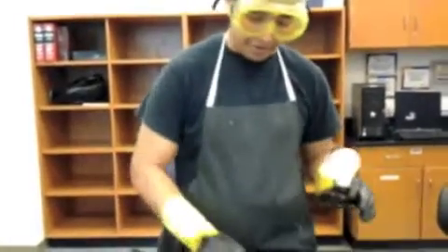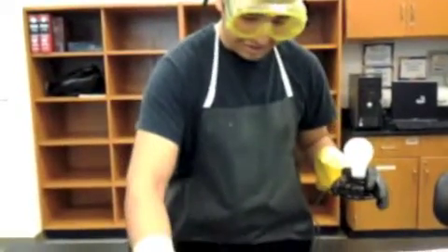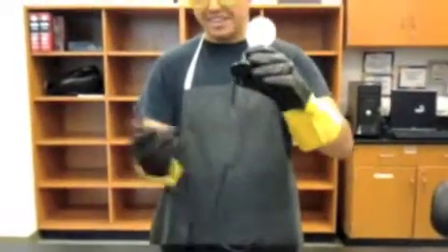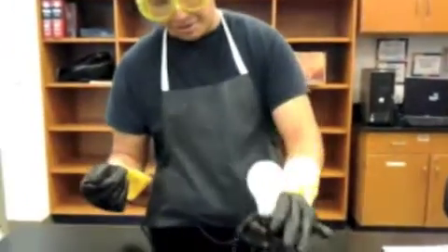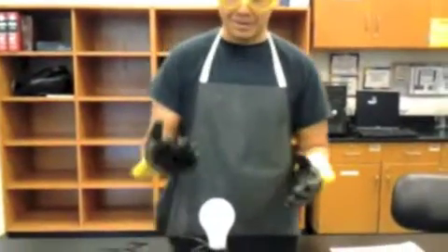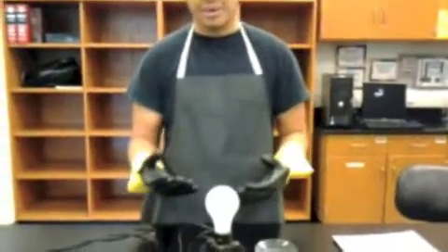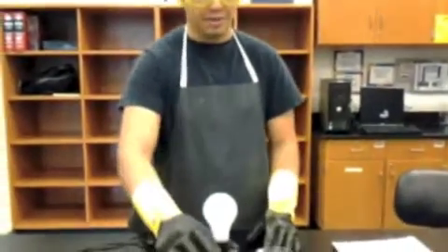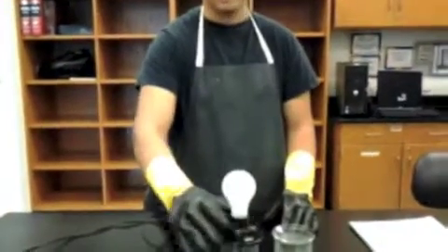Okay, so first, remember to take off the plate for safety, and put the light bulb in first, and then connect it into the outlet. And as you see here, the light bulb isn't lighting up, so therefore there are no electrolytes in the water, and that is the primary way that electricity flows through water, by the use of electrolytes.